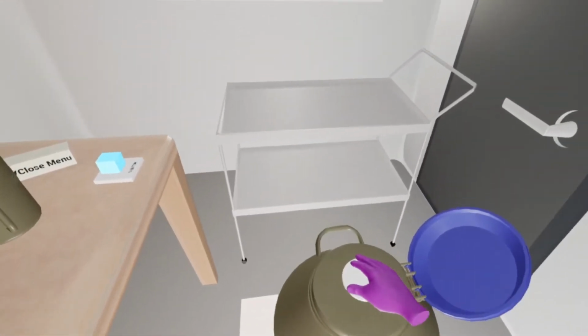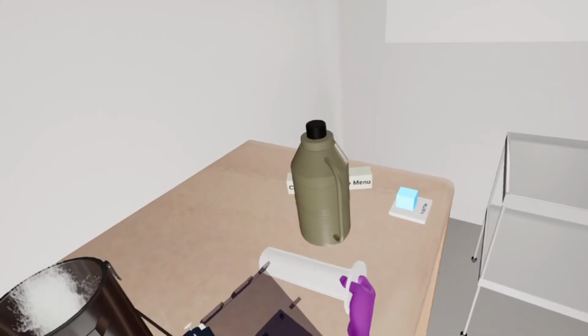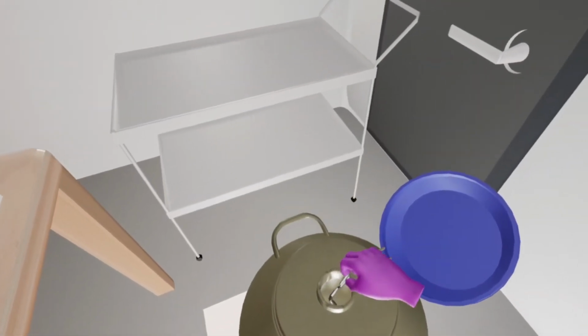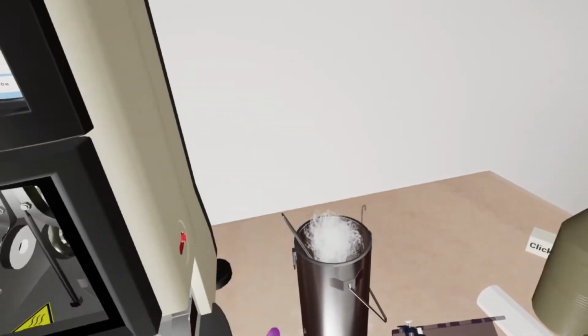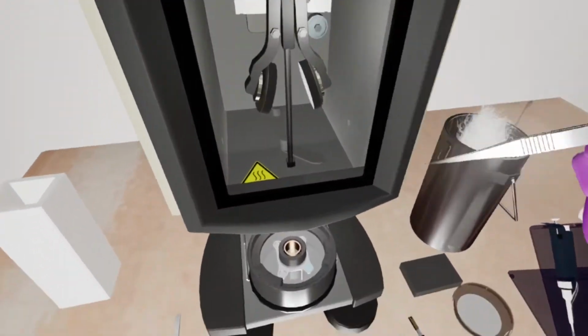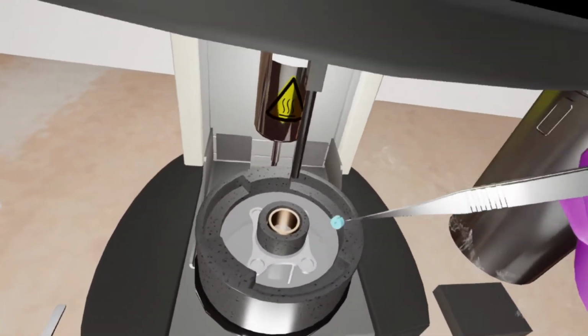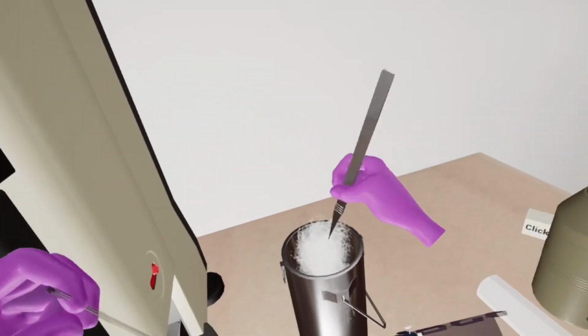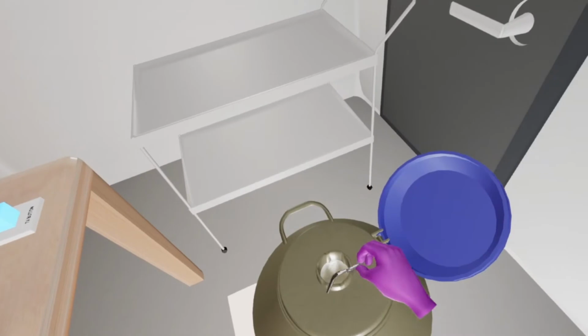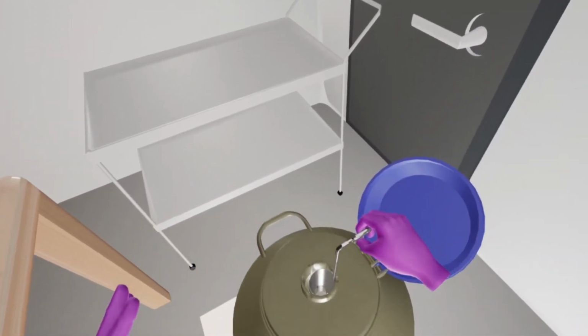Now let's use the large liquid nitrogen storage dewar on the floor to your right. Quickly transfer the plastic tube into the temporary storage dewar. Pick up your grid box from the workstation using the large, cooled down tweezers, and quickly put it into the plastic tube that's in the dewar. Put the plastic tube back into the large storage dewar and recap it.